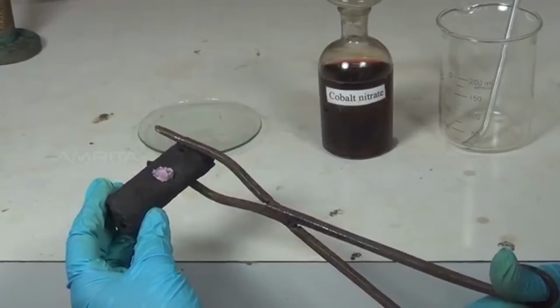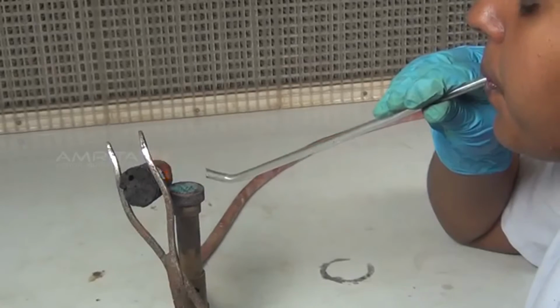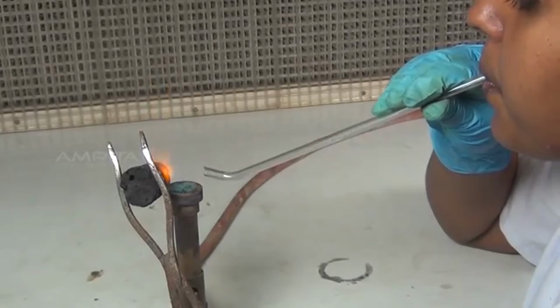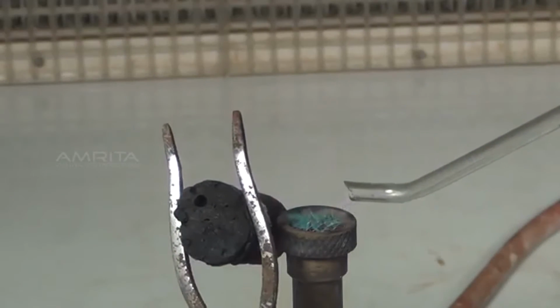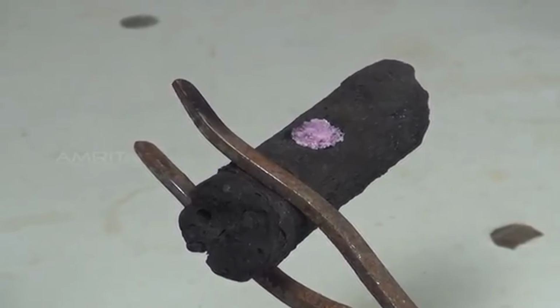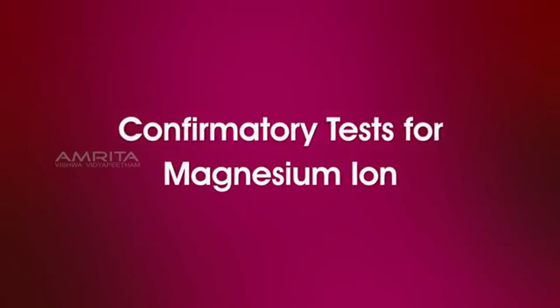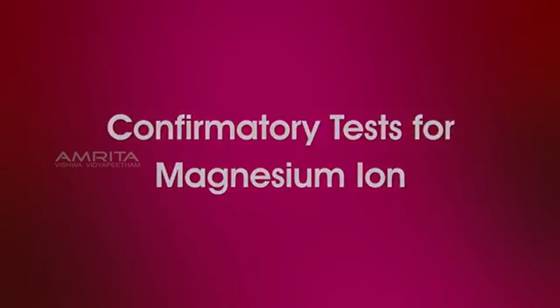Using the tongs, hold the charcoal piece in front of the oxidizing flame of the Bunsen burner. Now, direct the oxidizing flame on the cavity by means of the blowpipe and heat strongly for some time. Formation of pink residue indicates the presence of magnesium ion. Next, we look at the confirmatory tests for magnesium ion.